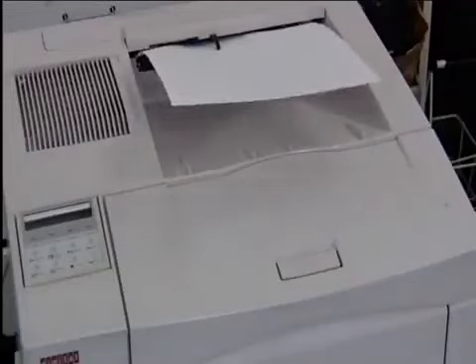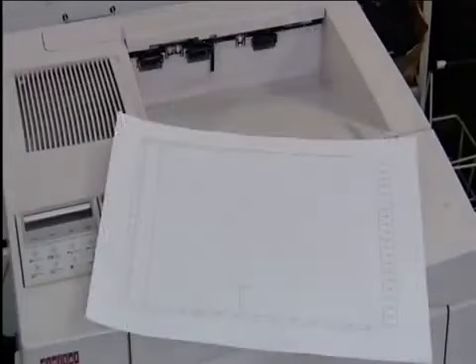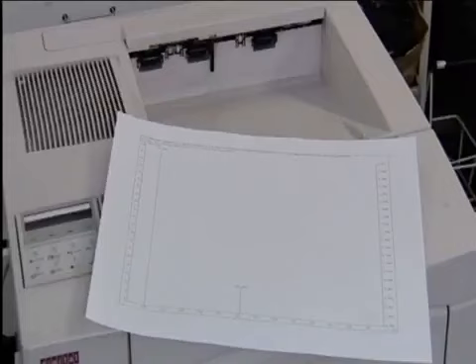Simple mass spectra show the masses of ions to the nearest whole number, which is fine for many purposes. However, this instrument can display masses to 3 decimal places of an atomic mass unit. This is called a high-resolution spectrum. It enables us to distinguish between different molecular formulae which have the same relative molecular mass to the nearest whole number.